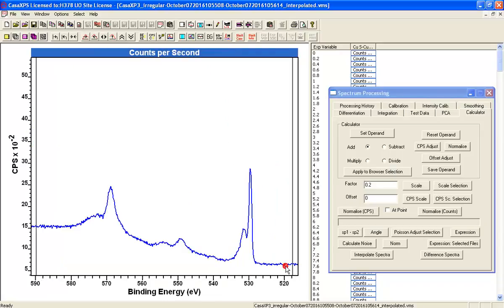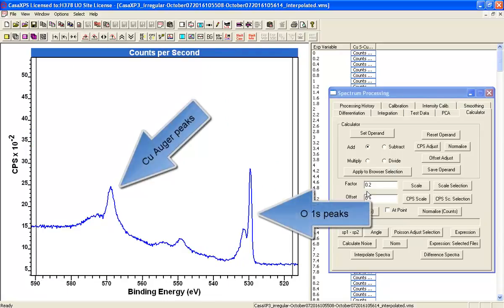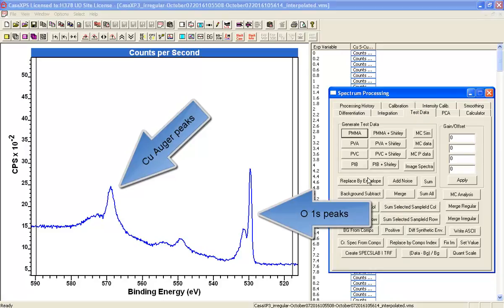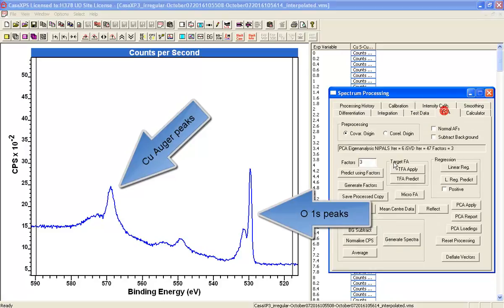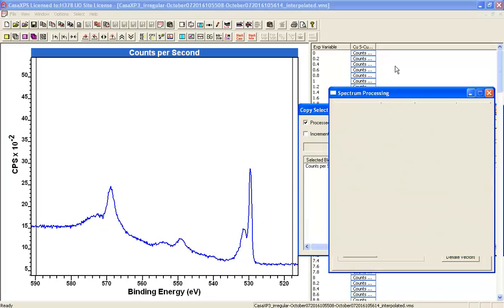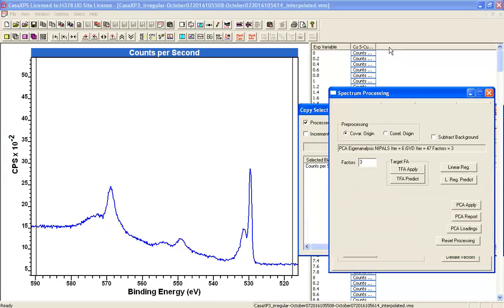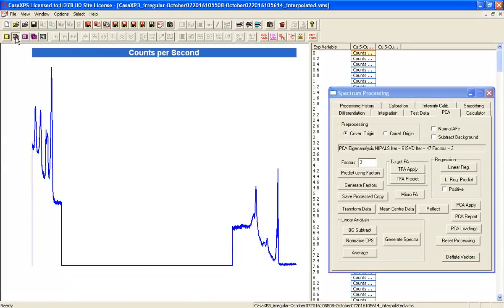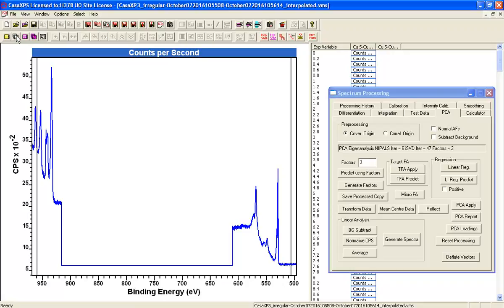So we need to now have a quick look and see what the Auger is looking like. And the Auger and the Oxygen 1S looks like respectable spectra. So we'll take that as an example of what might be beneath here.